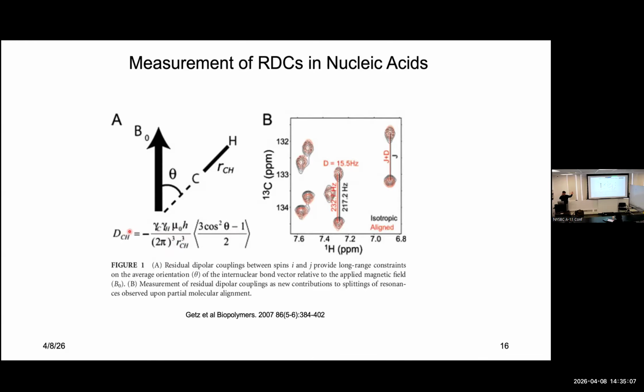Remember, if the argument in front of this 24,000 and theta is 0, it would be 24,000, but I'm measuring 24. If it was 90 degrees, it would be 12,000. But I'm measuring 24. So my 24 maps where on the function? Near the magic angle.